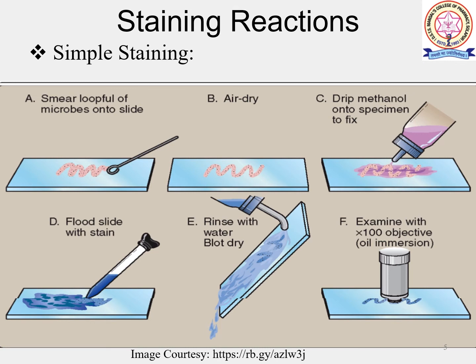Then the particular smear will be saturated with iodine, and the excess iodine will be gently washed. Then the slide will be placed on the microscope stage and focused under the 10x objective first. Then you have to select a particular area to focus on, use the oil immersion lens, and observe it under 100x power.